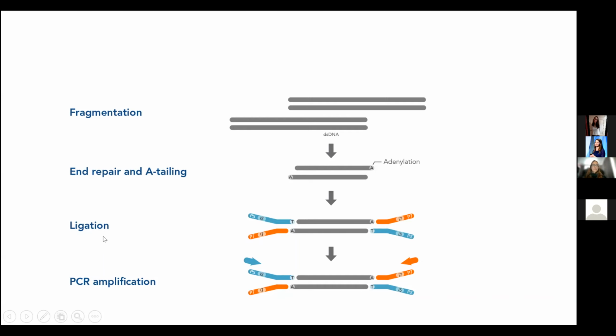So the next step, as I said, is adapter ligation, and adapters are basically sequences that are already known beforehand. We add adapters for several reasons.